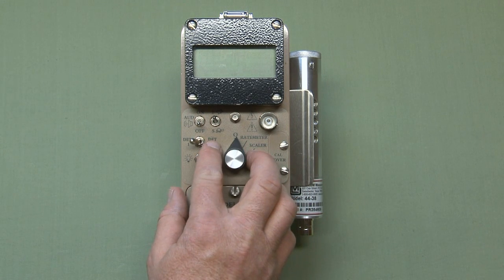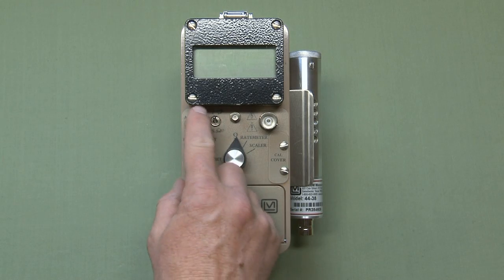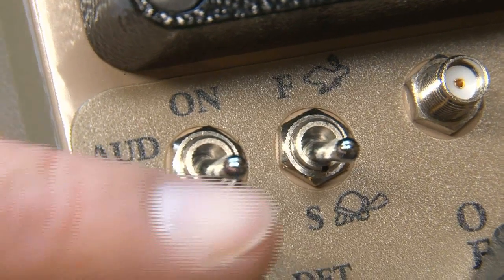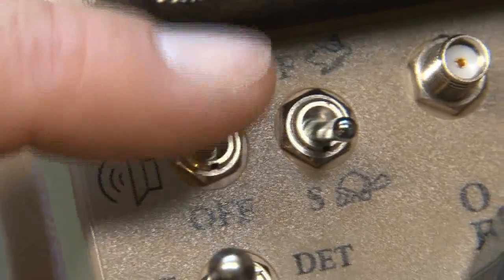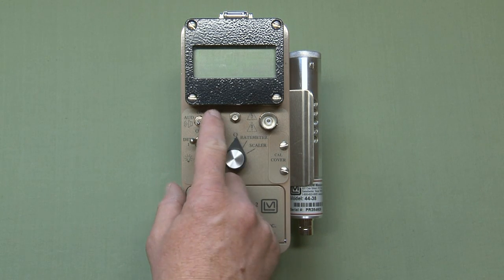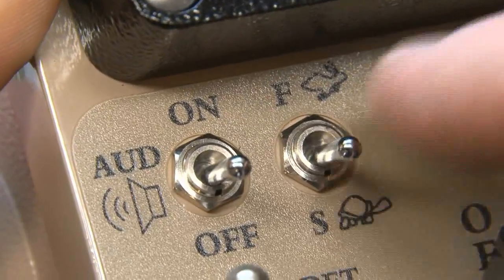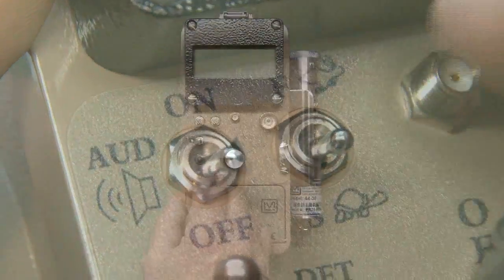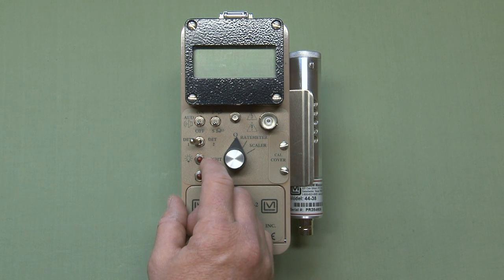The audio can be silenced or enabled by this toggle switch labeled 'AUD' for audio. You can turn it on for audio or off to hear nothing, except the alarm feature functions independently of this switch — even in the off position, if you reach the alarm threshold, the instrument will give you an audible alarm. This two-position toggle switch next to the audio allows you to switch between fast or slow counting response time. Fast response is used for initial surveys or locating a radiation source, while slow response is used when more accurate measurements are needed, with less fluctuation in the meter reading.